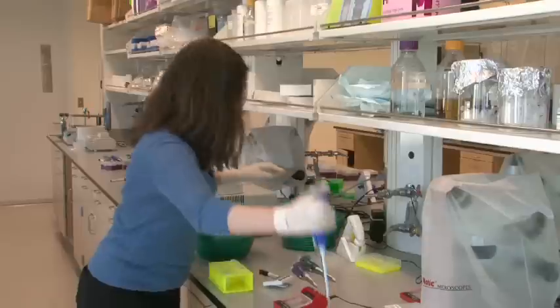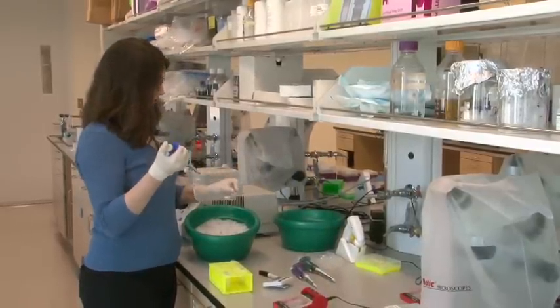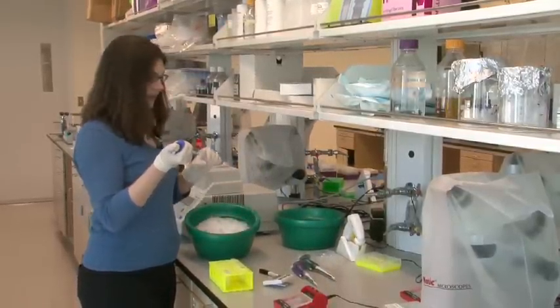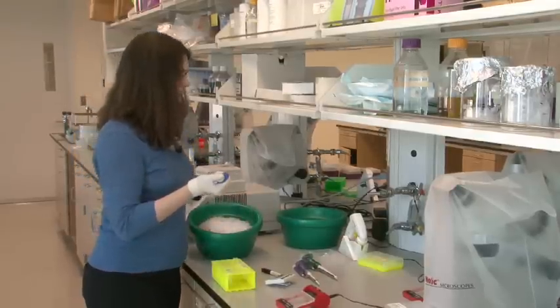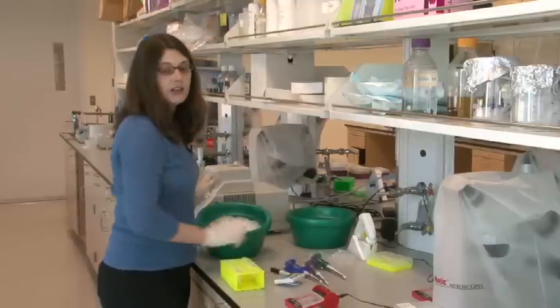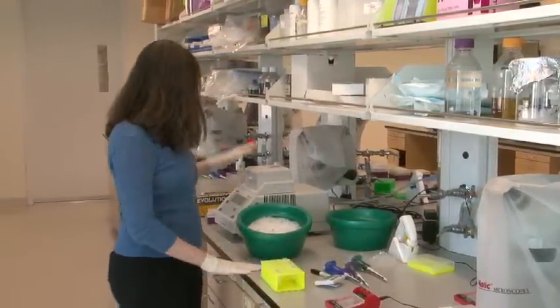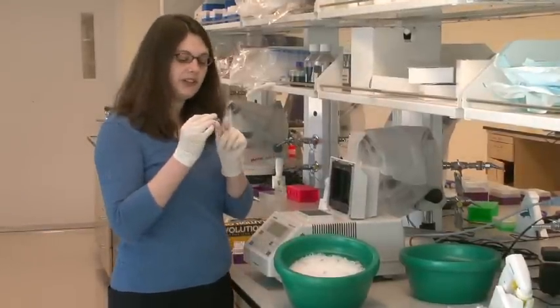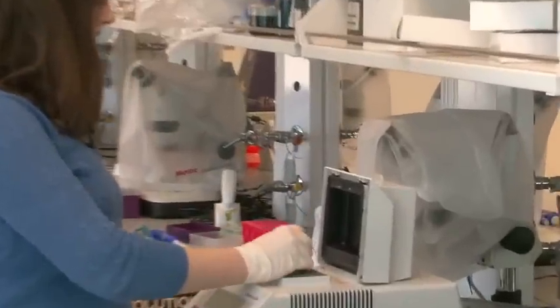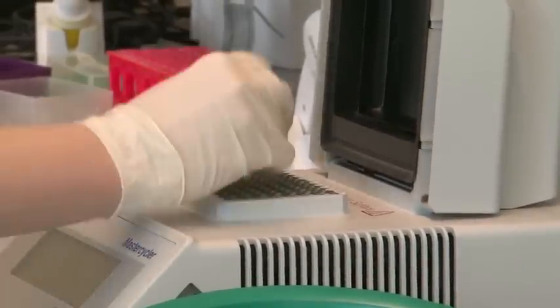So now that I have all of my DNA samples mixed with the necessary chemicals, I'll be putting these smaller tubes into what we call a PCR machine. So remember, PCR is the name of the technique to copy a segment of DNA to make many copies of it. And so this is my PCR machine right here. And these small tubes, I'll just give them a little mix there, and they fit right into these holes inside the machine.